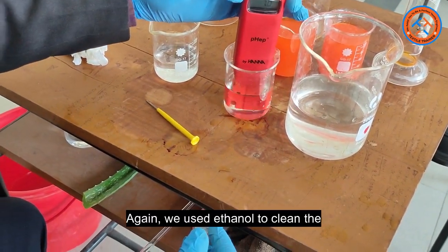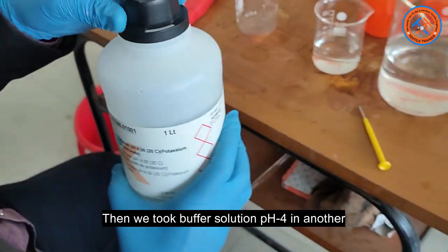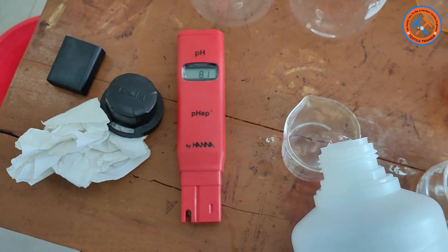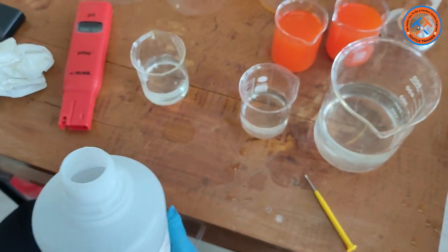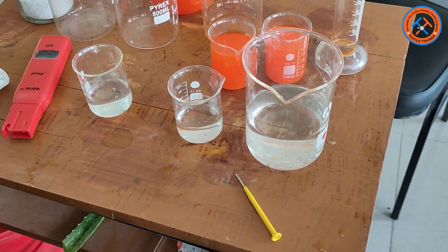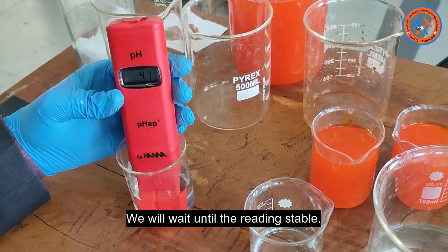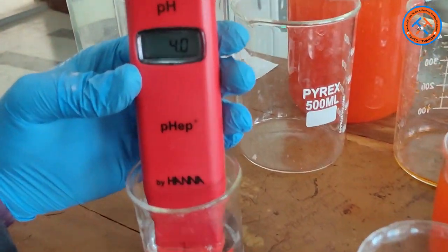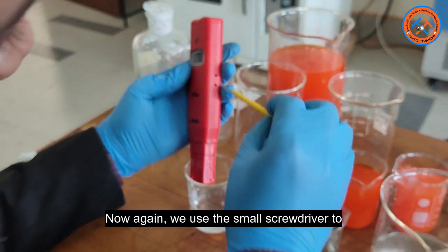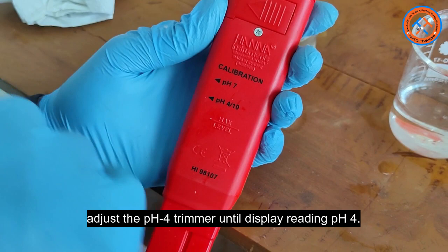Then we took buffer solution pH 4 in another beaker. Dip the tip of the electrode in the buffer solution. Now, again, we use a small screwdriver to adjust the pH 4 trimmer until the display reading shows pH 4.